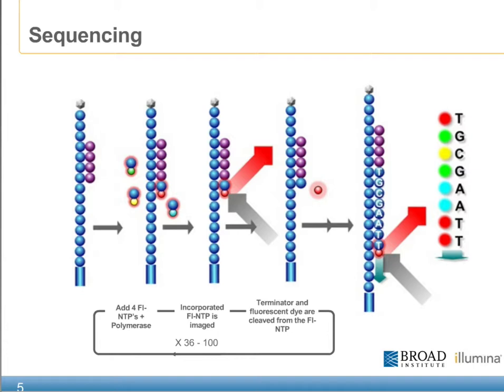This series of chemistry, laser excitation, and image acquisition steps represents a single cycle in the SBS chemistry. This cycle can be repeated as many times as the application requires.